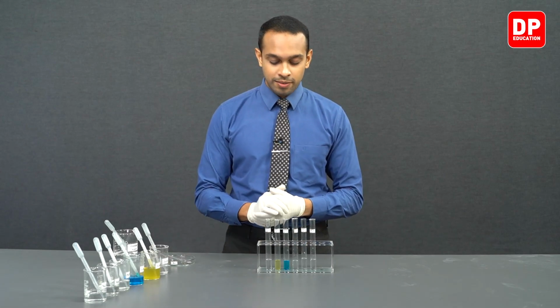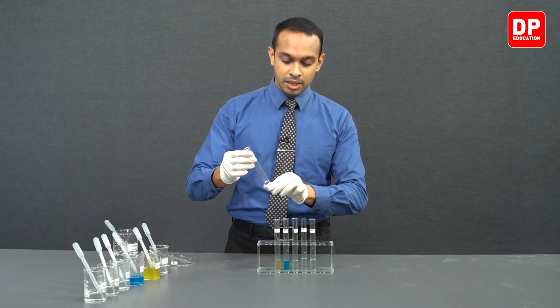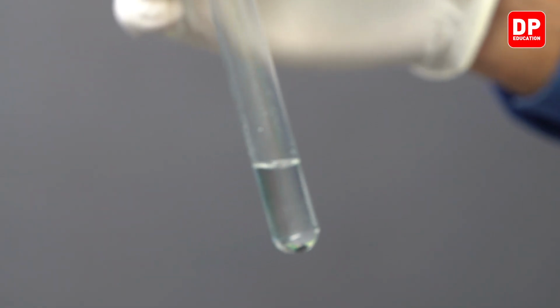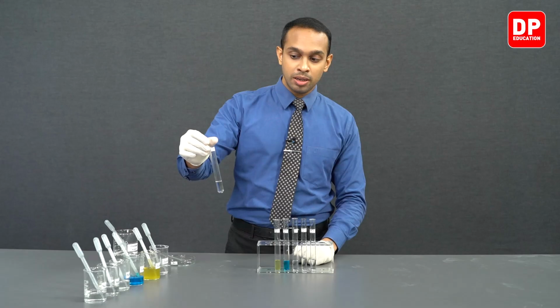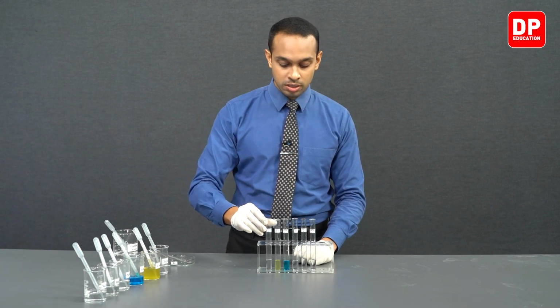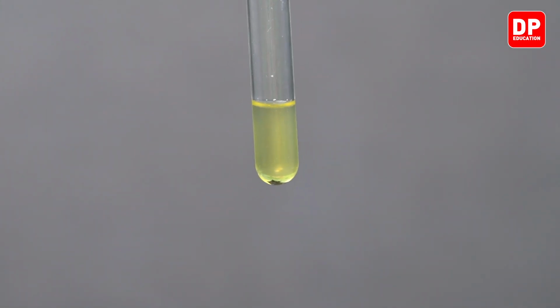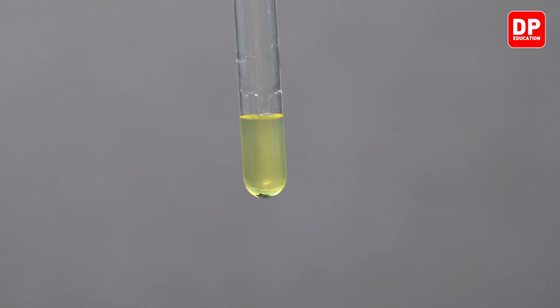Now students, we have added metal iron, or iron solid, into each of these test tubes. We can mix it well after adding the metal into each of these solutions, and we will mix and allow the reaction to take place for around 10 to 15 minutes.